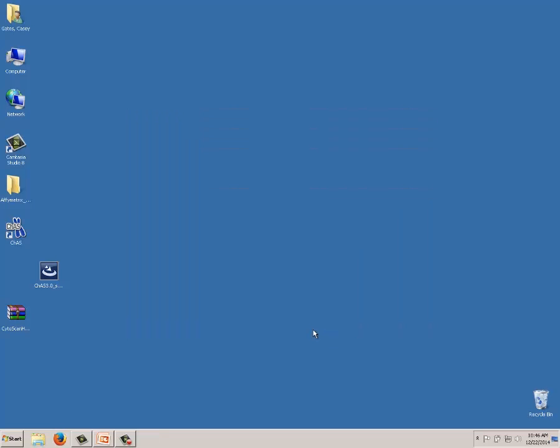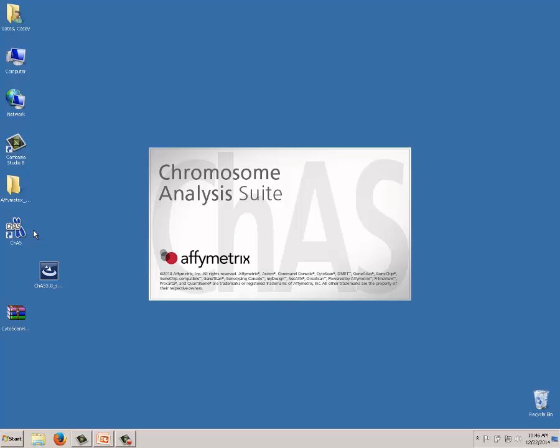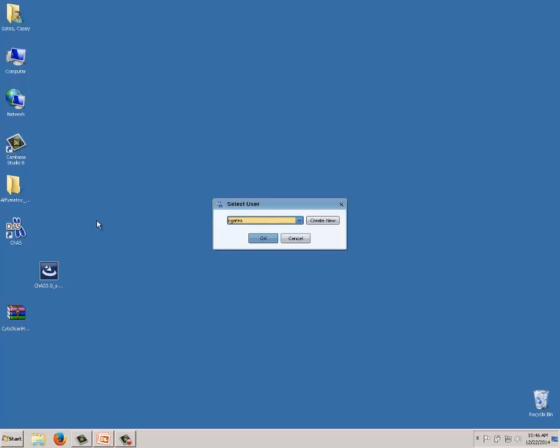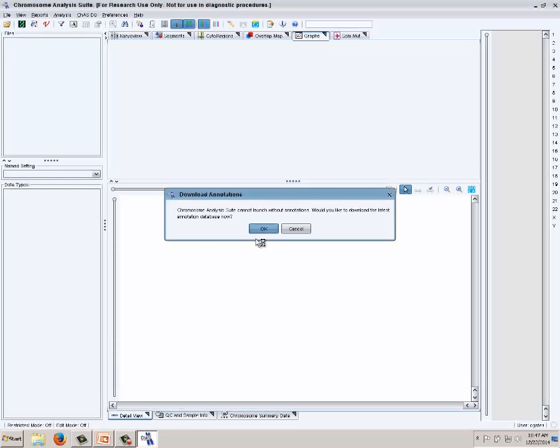The next part of setup is installing the library files. First we'll show how to do it through the software. Double-click the new CHAS icon. As the software launches, you'll be asked to select a user — similar to previous versions, helpful when multiple users share a workstation. CHAS keeps your table and graph settings under your user profile. I select my user login and click OK. The software then notifies me that it cannot launch without library files and asks if I want to download them now.